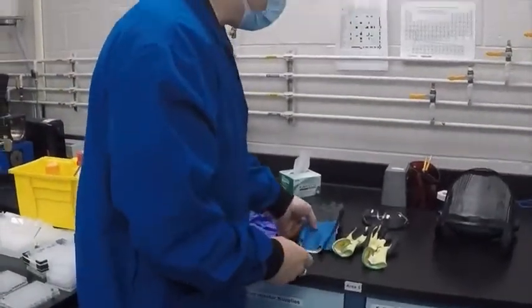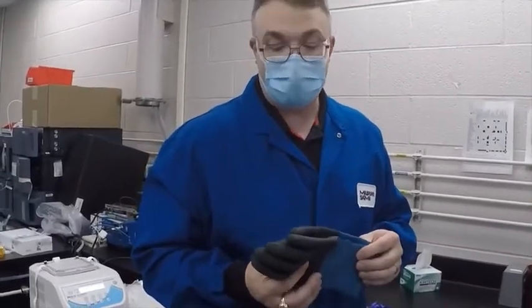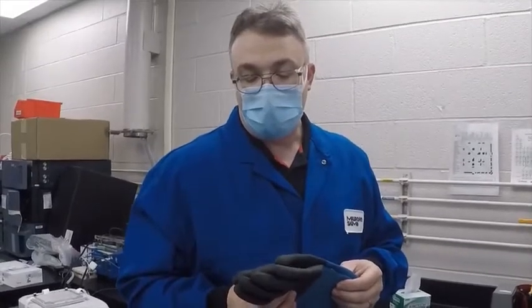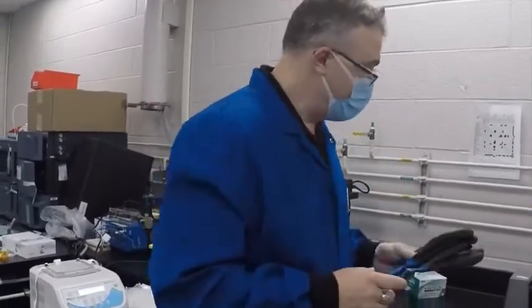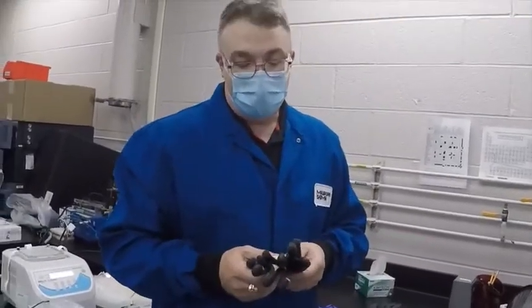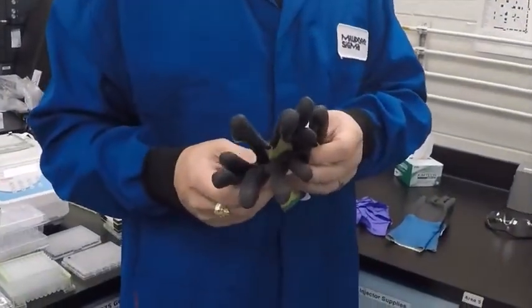If you're working with more hazardous materials like caustics, acids, or more severe solvents, you want to go to a heavier style glove which is built for more hazardous conditions and provides more protection for the user. If we're working with sharps — needles or ampules where you're breaking the ampule open — you want to go to a cut-resistant glove.